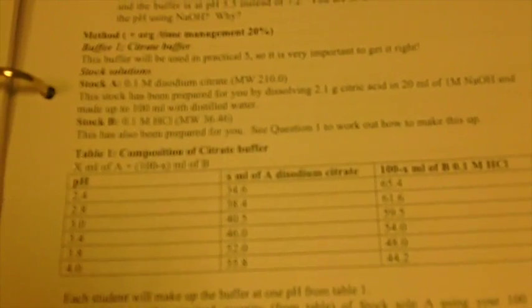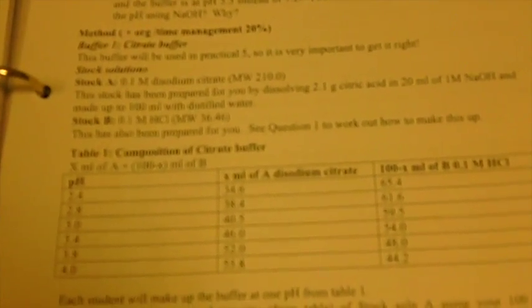For the first part of the practical, you're required to make a citrate buffer. This citrate buffer is made up from two solutions: stock A, which is a 0.1 molar disodium citrate buffer, and stock B, which is 0.1 molar HCl.